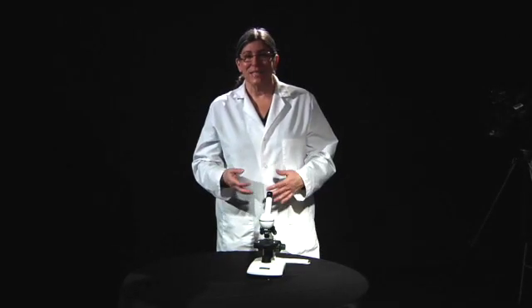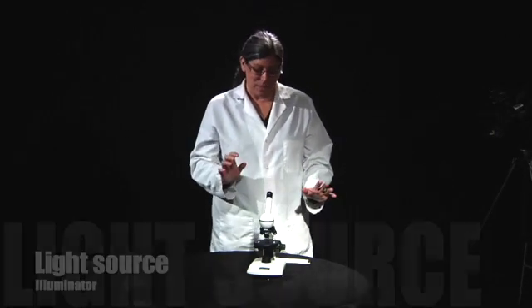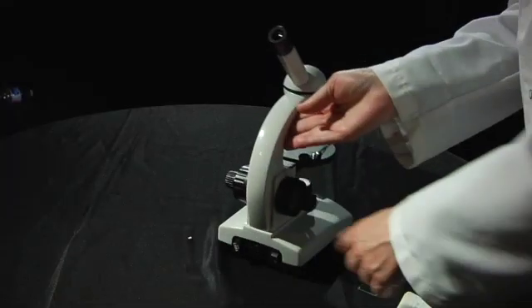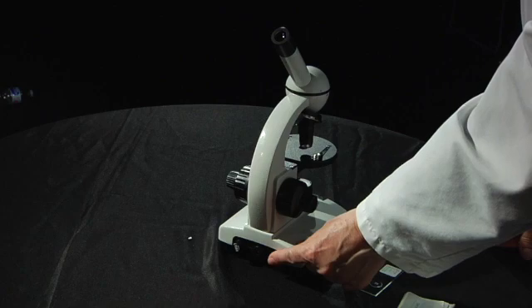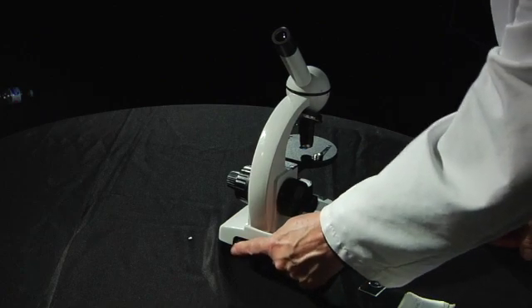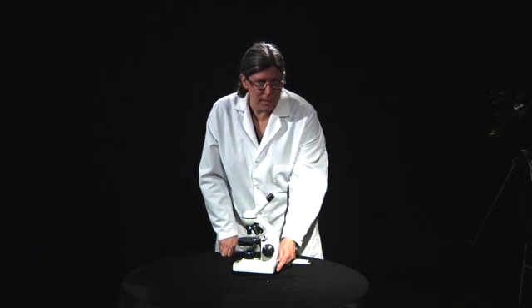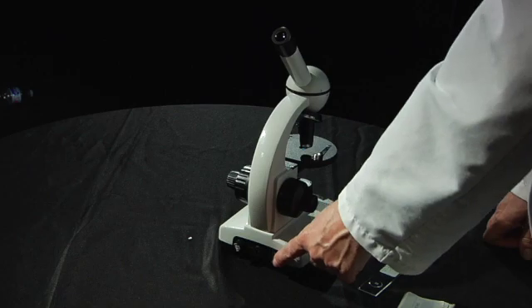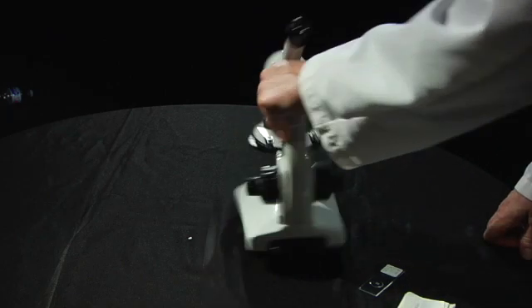The next thing that we're going to learn about is the light source, also known as the illuminator. You're going to turn that on by finding the switch on the back of the microscope and clicking it on. Don't play with the fuse. If the fuse comes loose, you can try to tighten that back up again, but generally we're not going to touch the fuse — just the on/off switch, which turns on the light source.